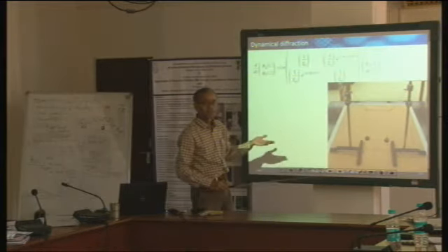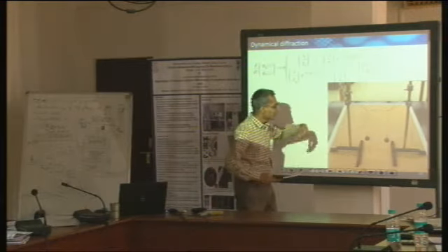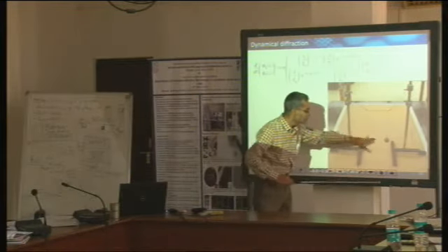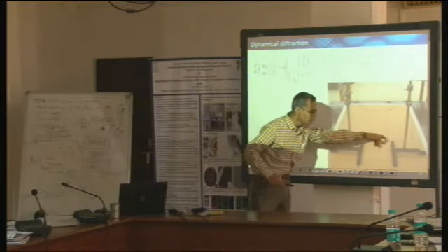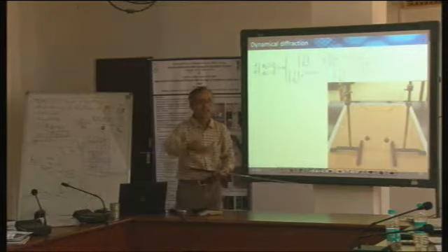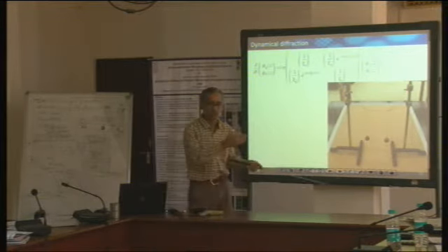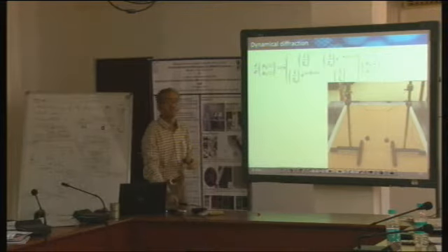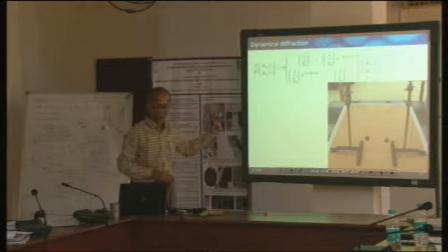But under dynamical considerations, through this interaction, slowly the vibrations will be transferred from this to this. This will at one point of time even become stationary and only this will be moving. After again some time, it will transfer the energy back to the first one and so on. So our thickness fringes and all these dynamical effects which we are seeing are actually like this.